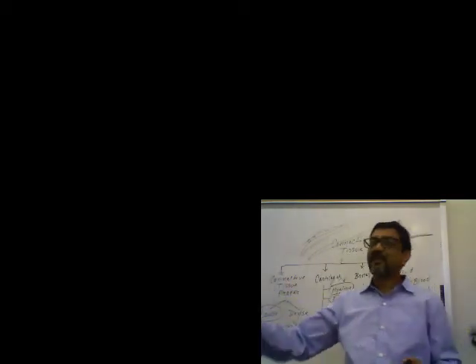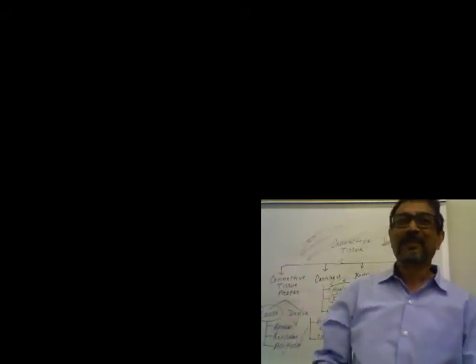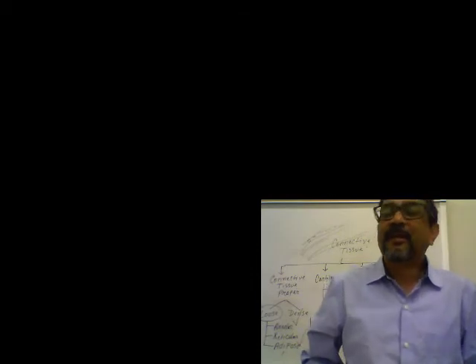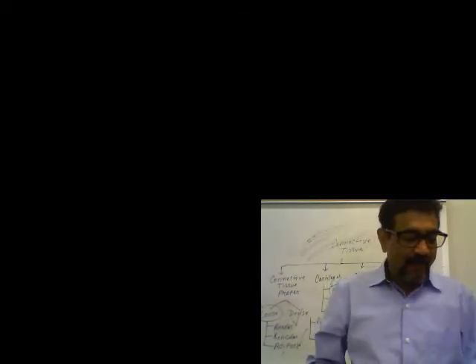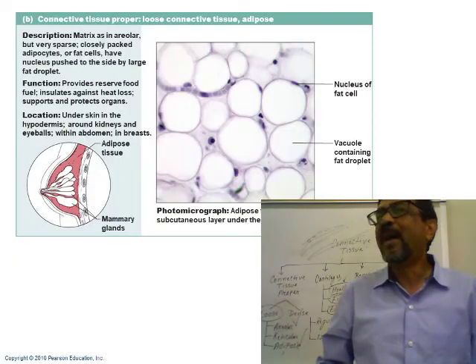Now, we are done with areolar. Adipose. How many of you remember this one? You should remember. This is easier. You see, the adipose cells look white.